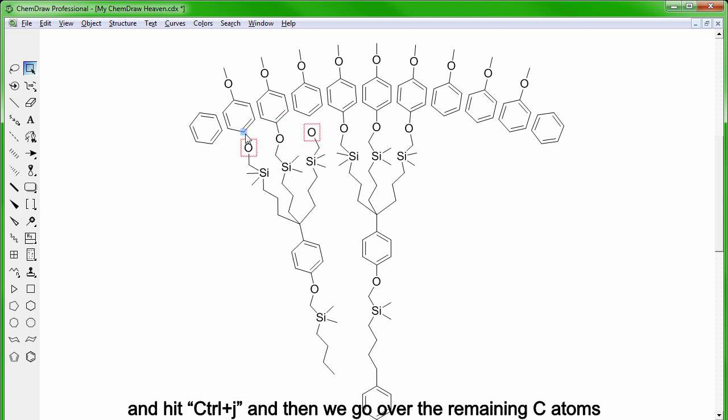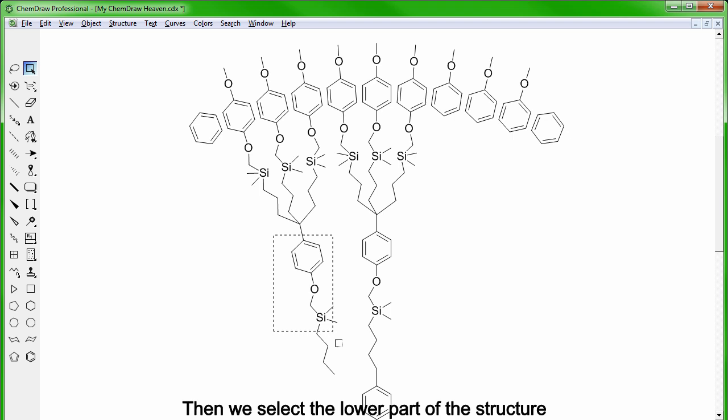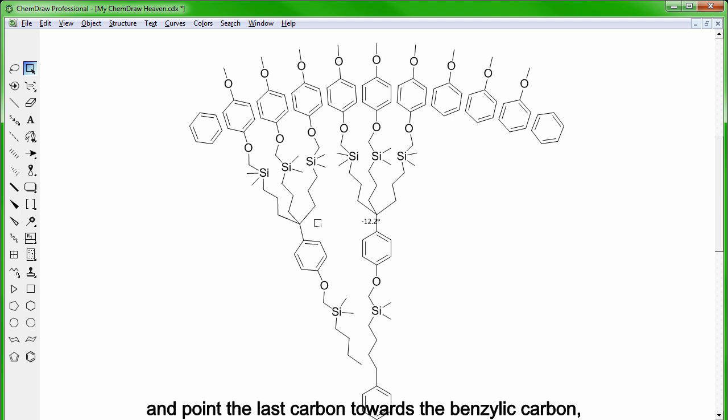Then we go over the remaining carbon atoms and press 0 to sprout bonds that will go directly onto the oxygen atoms since they're close by. Then we select the lower part of the structure and point the last carbon towards the benzylic carbon and we do the same thing on the other side.